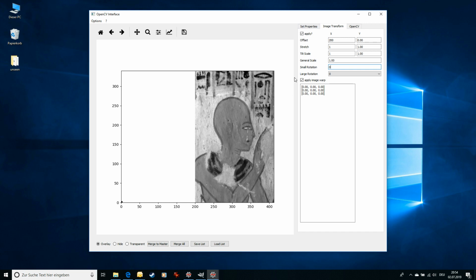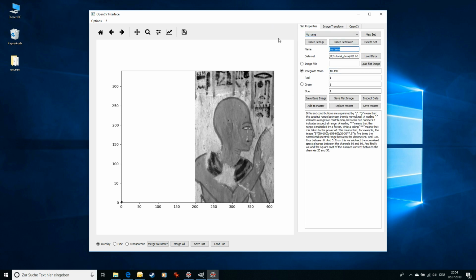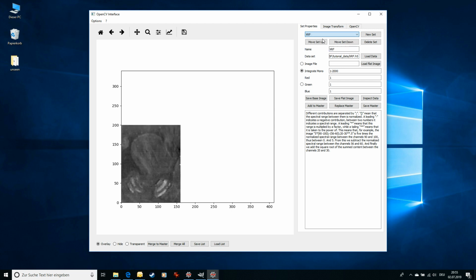What we now want to do is align the reflectance imaging spectroscopy image with the XRF image. However, for this we need to detect features in both images that are similar. Now we can look at this image, and the two main contributions to making it darker are the iron-based red and pink ink and the copper-based Egyptian blue in the color. In addition, we also have the black carbon paint, which was used for the hieroglyphs, but we unfortunately cannot detect that with XRF.